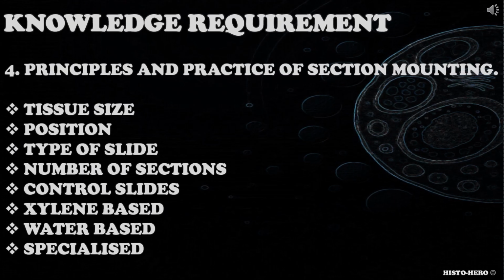The fourth knowledge requirement is principles and practice of section mounting. Candidate needs to have the knowledge and understanding about the principles and practice of section mounting. You could ask the candidate to explain what section mounting is and why it is performed, what the key steps of section mounting are, what mounting media is used in your lab, what the difference is between them, and when would they use each media and why.